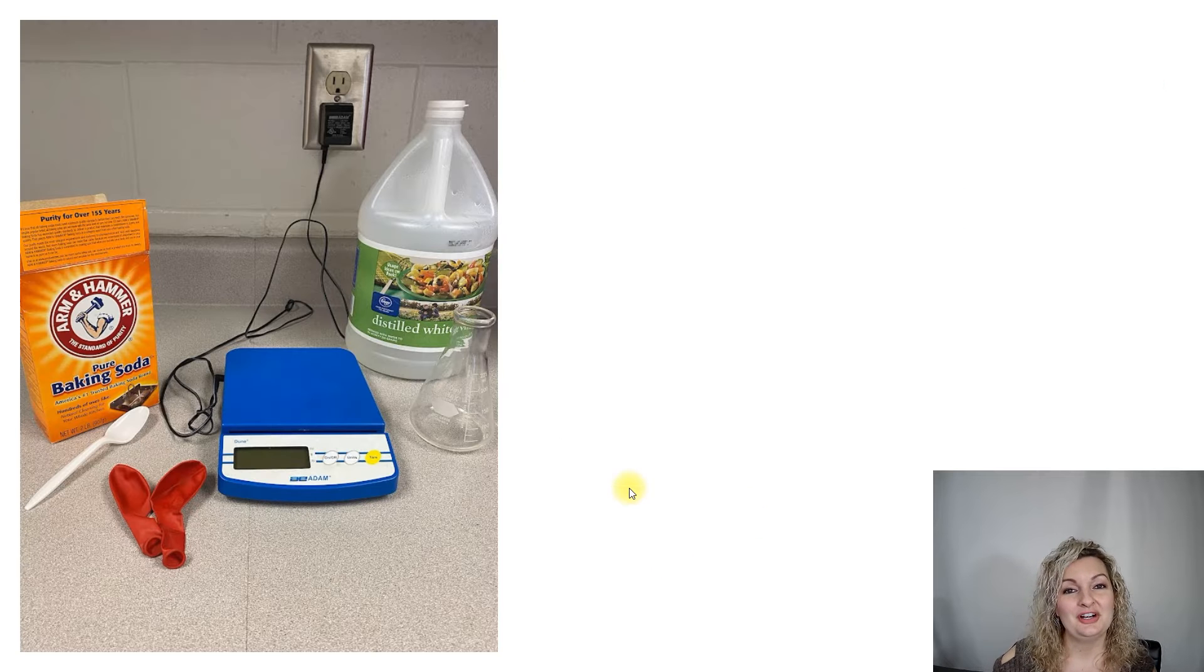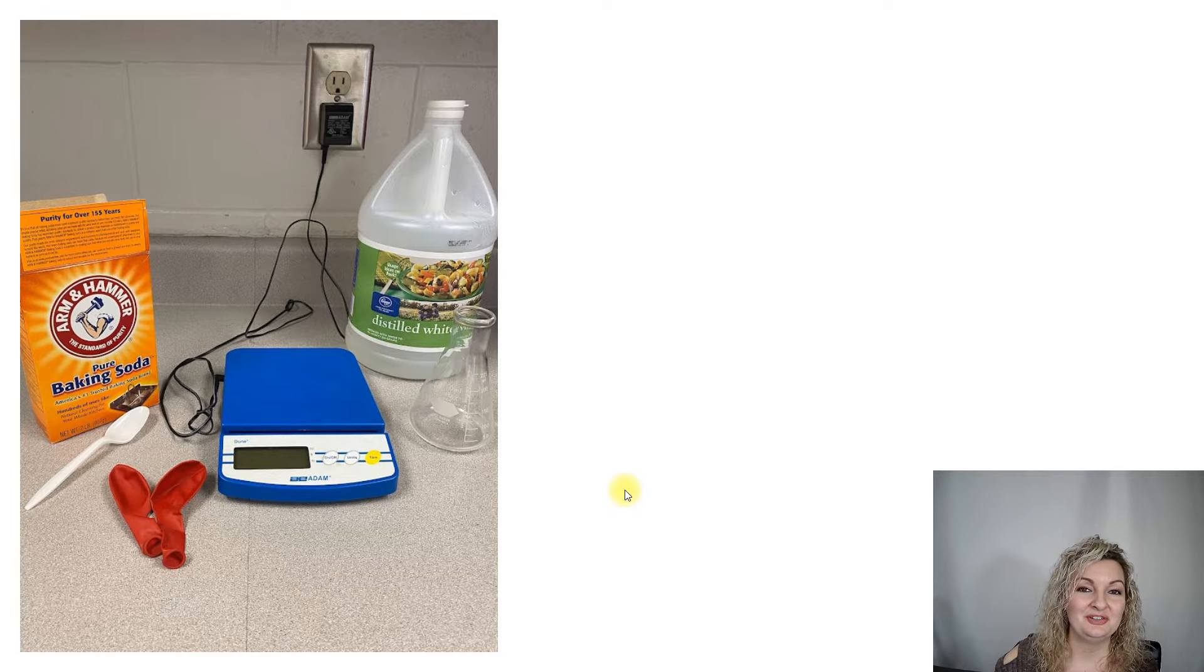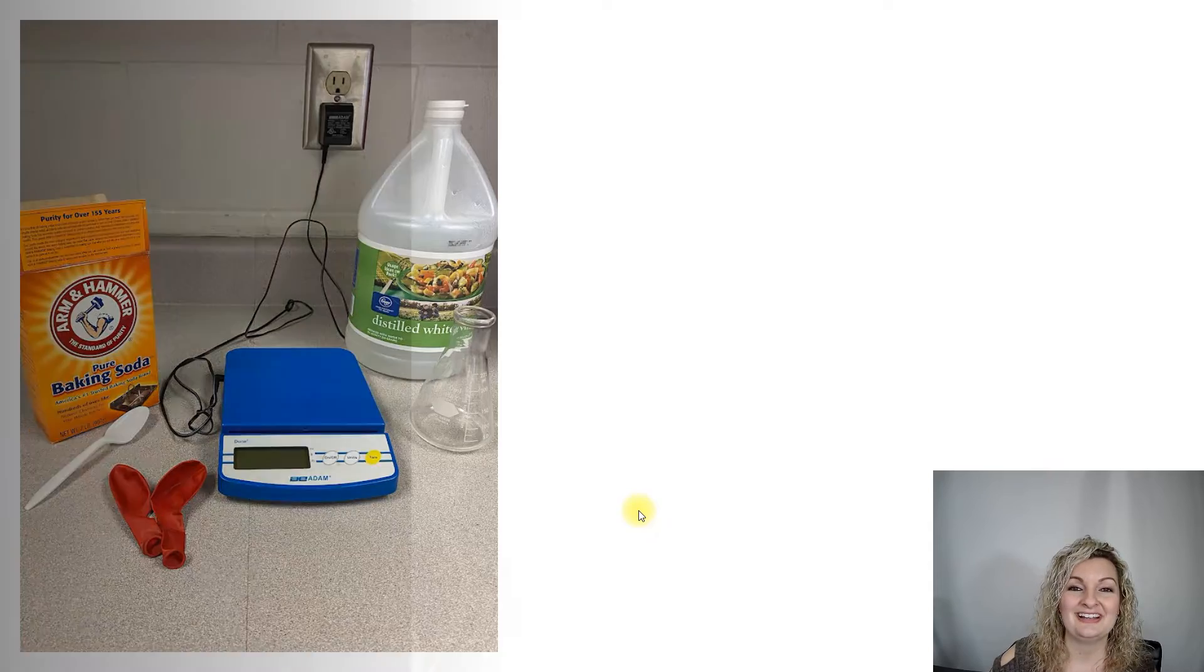So we're going to start and we're going to use all of these materials here that you see. We're going to be mixing vinegar and baking soda inside a flask. We're going to need a spoon, some balloons, a scale. I'm using a digital scale today and you're going to need just a little cup in order to measure out your baking soda. So let's go ahead and get started.